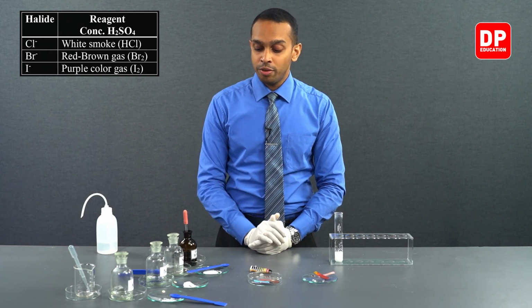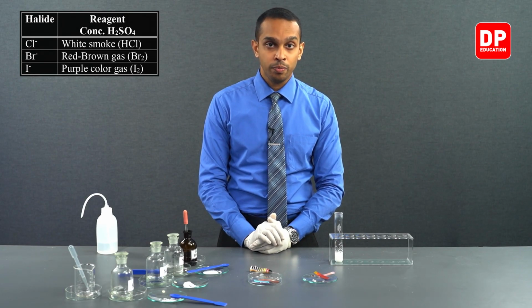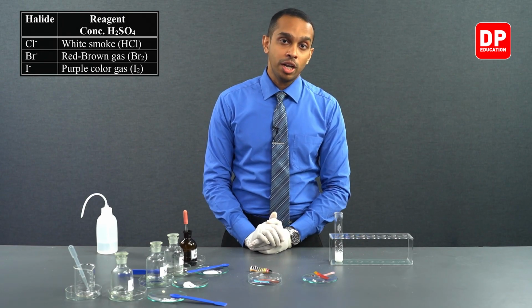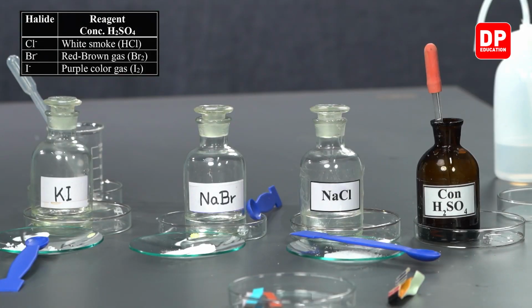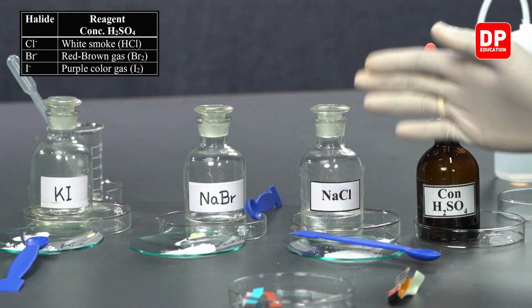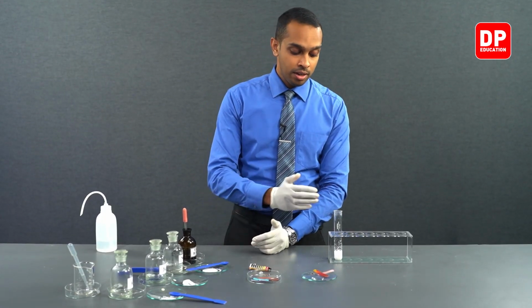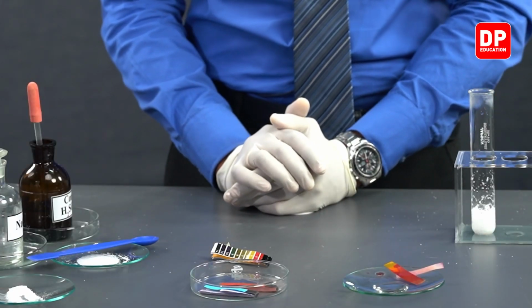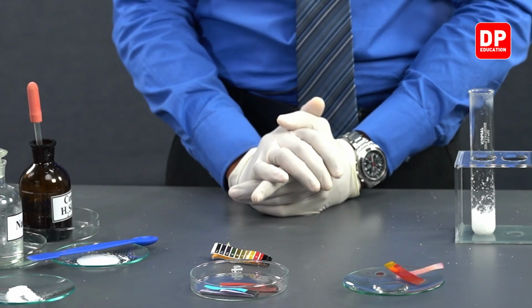And when we added concentrated sulfuric acid to sodium bromide, we saw orange color effervescence being formed, indicating the formation of bromine gas, which is an orange color gas. Finally, when we added concentrated sulfuric acid to sodium chloride, we saw that a white color gas was formed, or we call it misty fumes, that is acidic in nature.